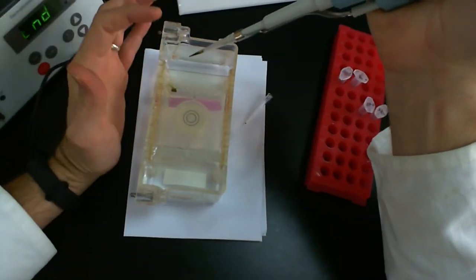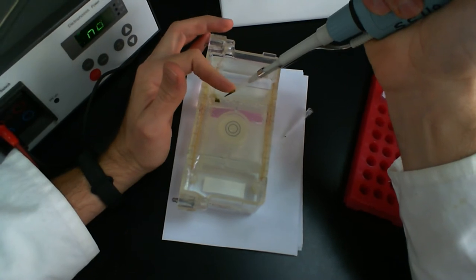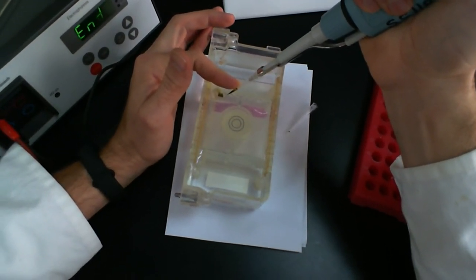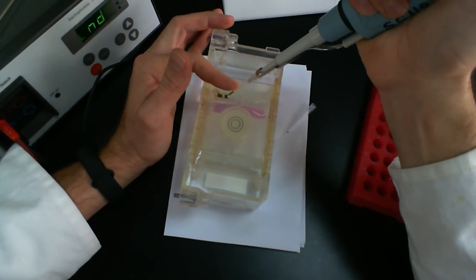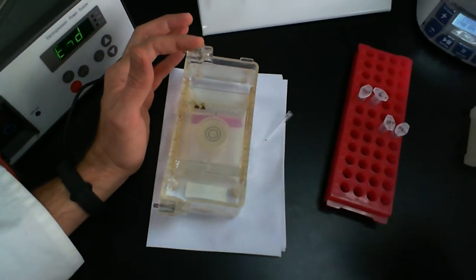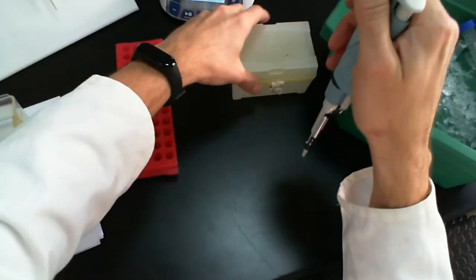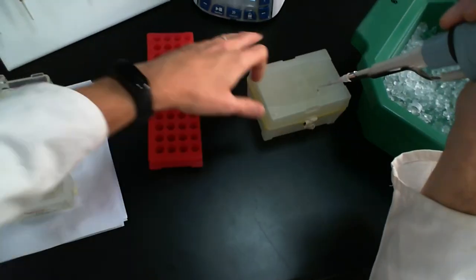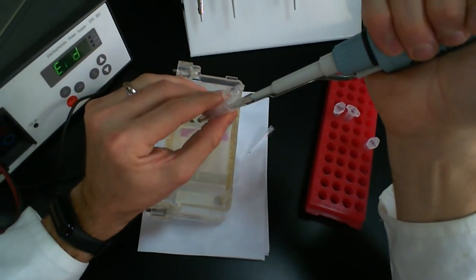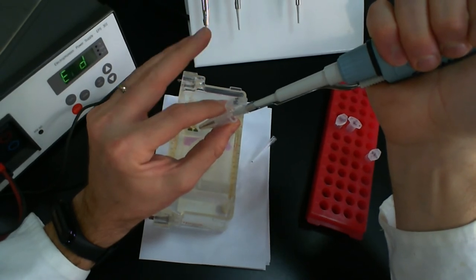And again, just plant yourself so that you're secure. Your hand is not shaking, your tip is not shaking. You can guide your tip into the well. And just slowly eject into the well. Okay? Again, let me do another one. Okay, so just be patient.